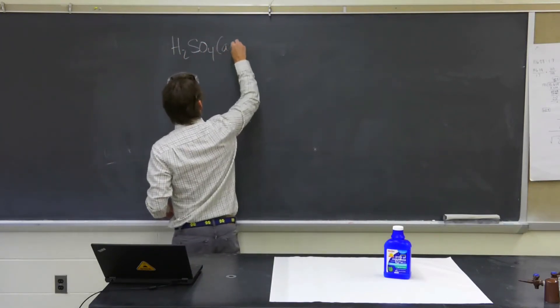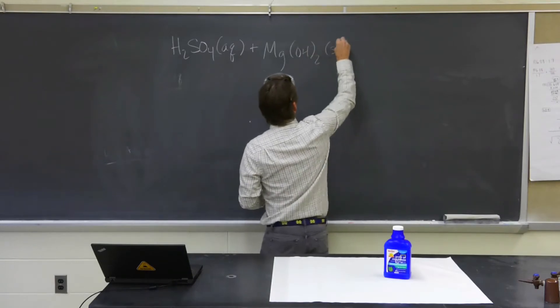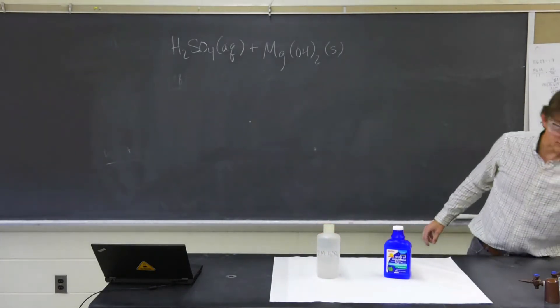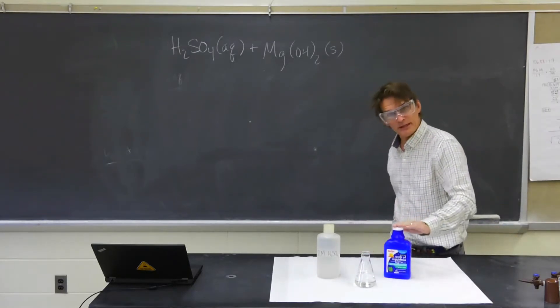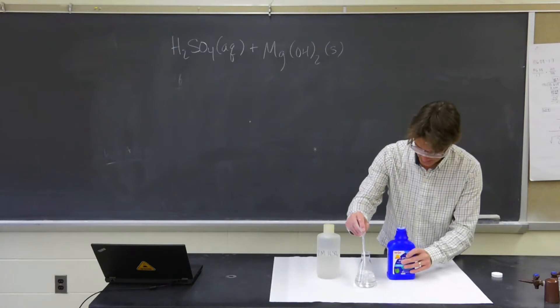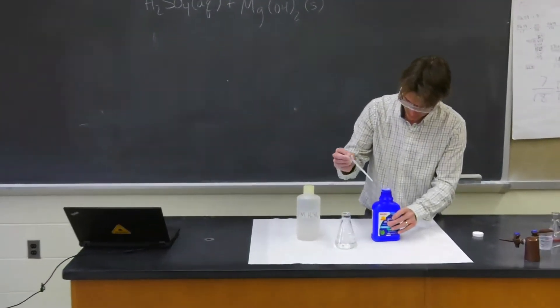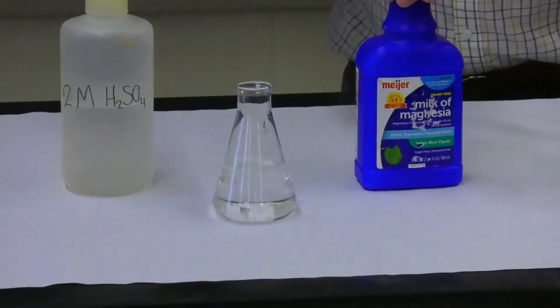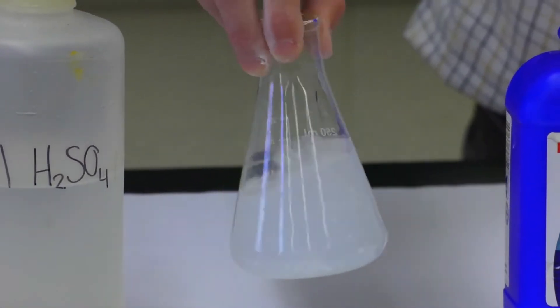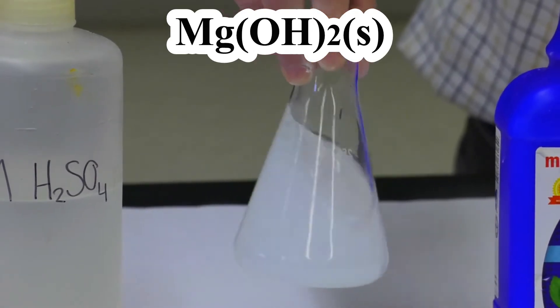Sulfuric acid dissolved plus magnesium hydroxide — that's the active ingredient in milk of magnesia. Here's the sulfuric acid I'm going to be using, and I have some water that I'm going to place the magnesium hydroxide in. It looks very white and doesn't look like it's dissolving well into the water. That's why I've written the magnesium hydroxide as a solid — it does not dissolve well at all. See that cloudy mixture? That tells me there are little solid particles in there. We have a heterogeneous mixture of water and undissolved solid particles of magnesium hydroxide.